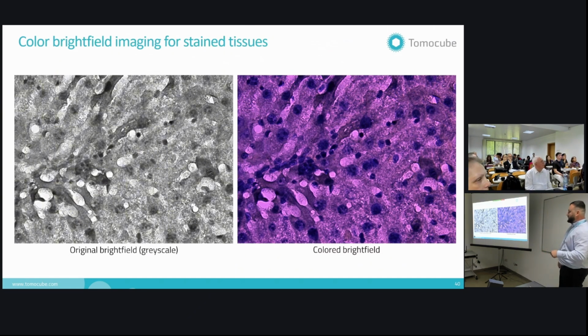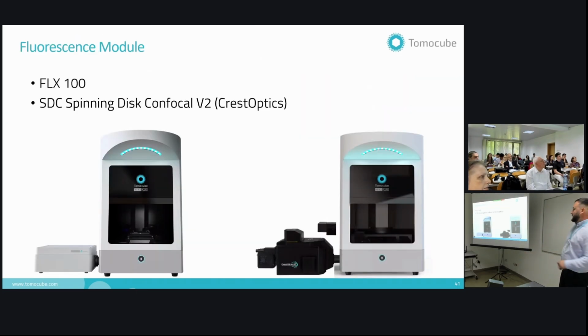And because we have those three colors, we have the classical bright field, color bright field, as well. So you can do holotomography, channel 1, channel 2, channel 3, 3D fluorescence plus bright field in every single position at every single time point if you want to. Of course, you don't have to, but in reality, you're going to use the holotomography and bright field in most cases. Bright field is not going to give you as much information, but it's always nice to see the complement of other stuff.